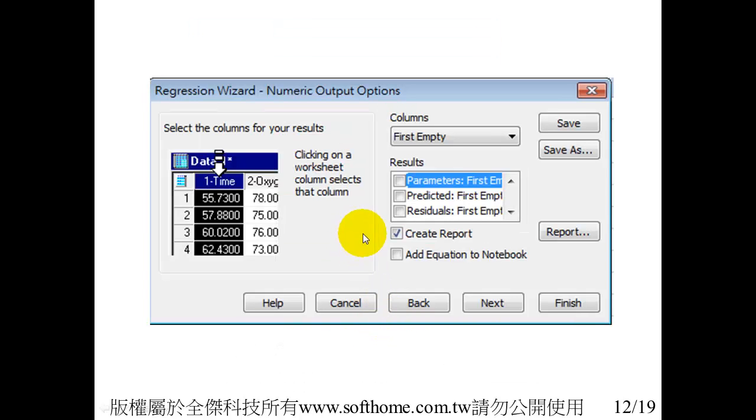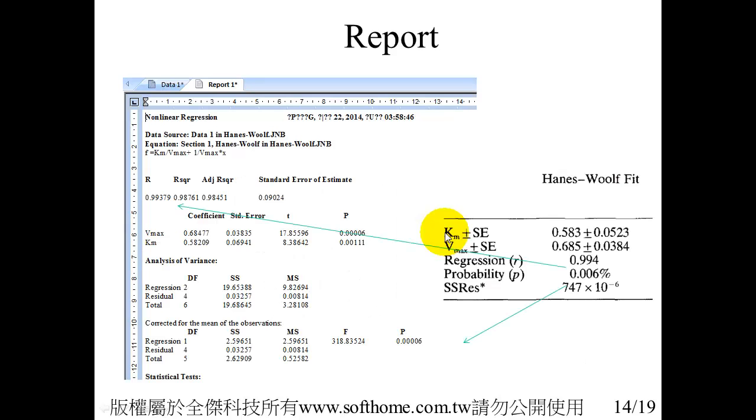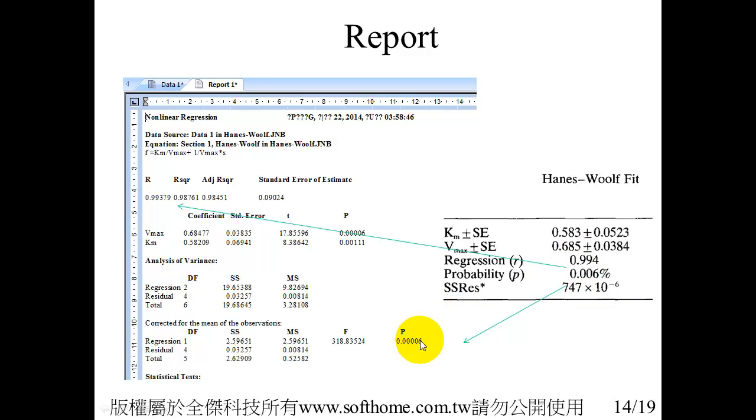And then when you create a report, you can also see the regression R square and the probability p-value.